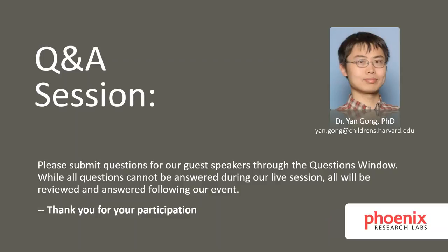So let's get started. Question number one: is there an optimal animal age for inducing the CNV model? According to our experience and our results, as well as the detailed information from the JoVE paper by Stephen Poole, the younger mice around 6 to 8 weeks old are much better ages for the laser-induced CNV model because they generate more consistent CNV lesions, and there is no gender difference between the mice at this age.